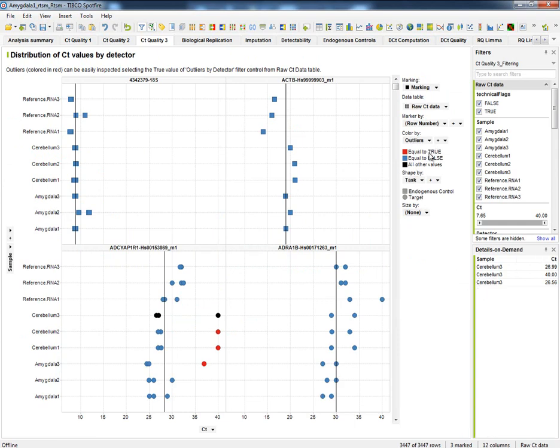In this example, we can identify some different scenarios where this reference control has replicates with very similar values. This is the expected behavior. Another one which has not been replicated at all. 3 replicates per samples. Outliers are represented in red. And finally, 2 replicates where no outliers have been detected, since we need at least 3 values to determine an outlier.